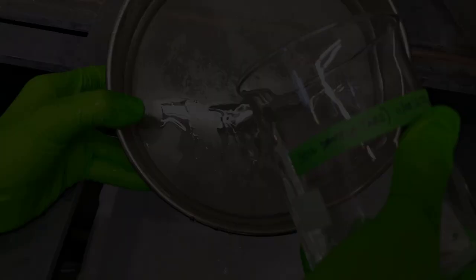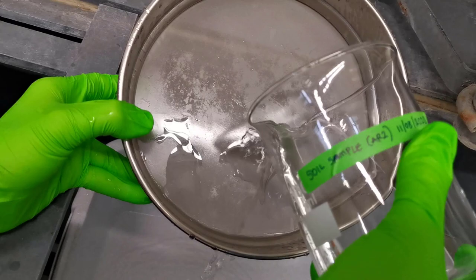For sieving, pre-wet a sieve of mesh size of at least 35 micrometer which will hold the nematodes. Pour the nematode suspension on the sieve, letting the water pass but trap the nematodes on the mesh.